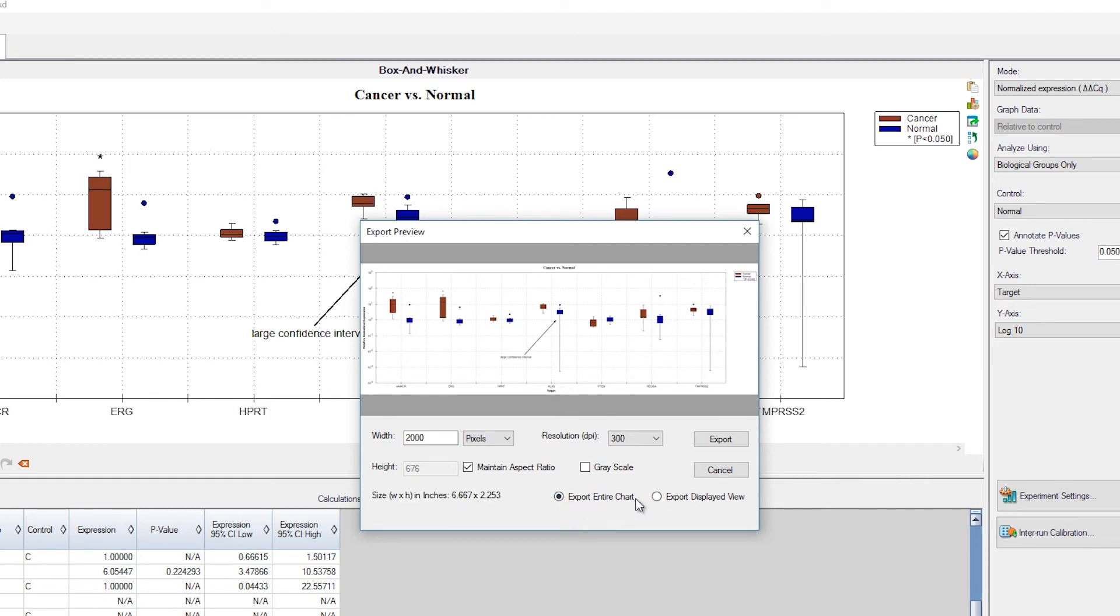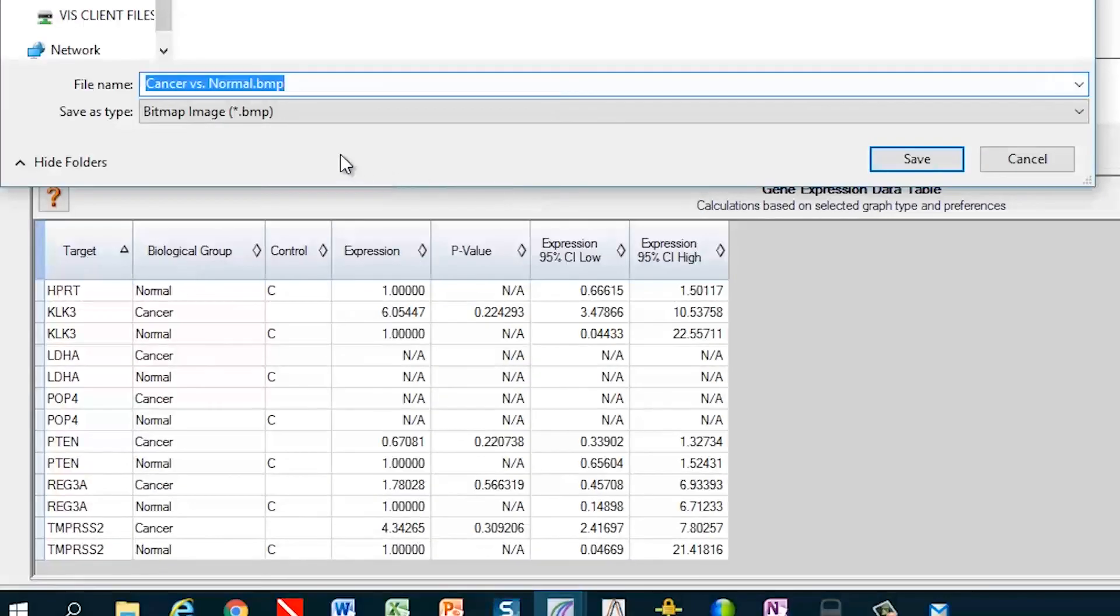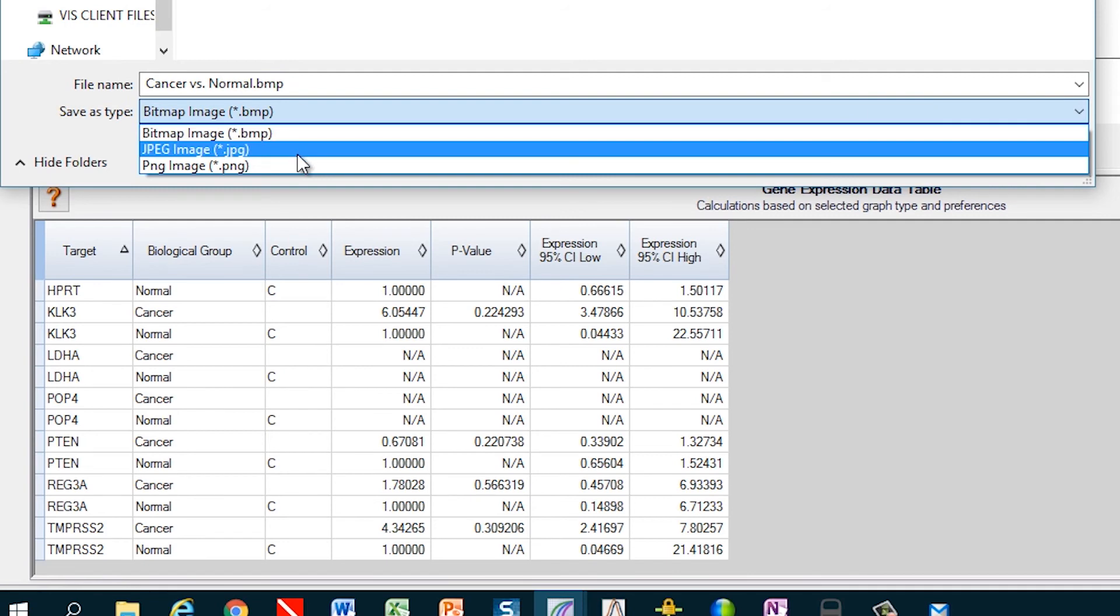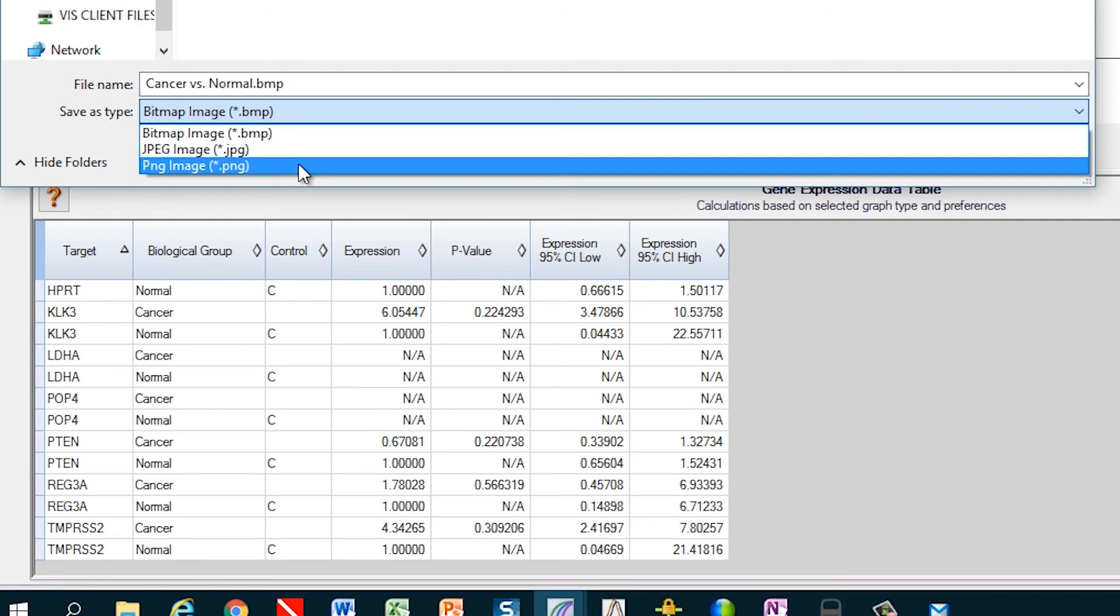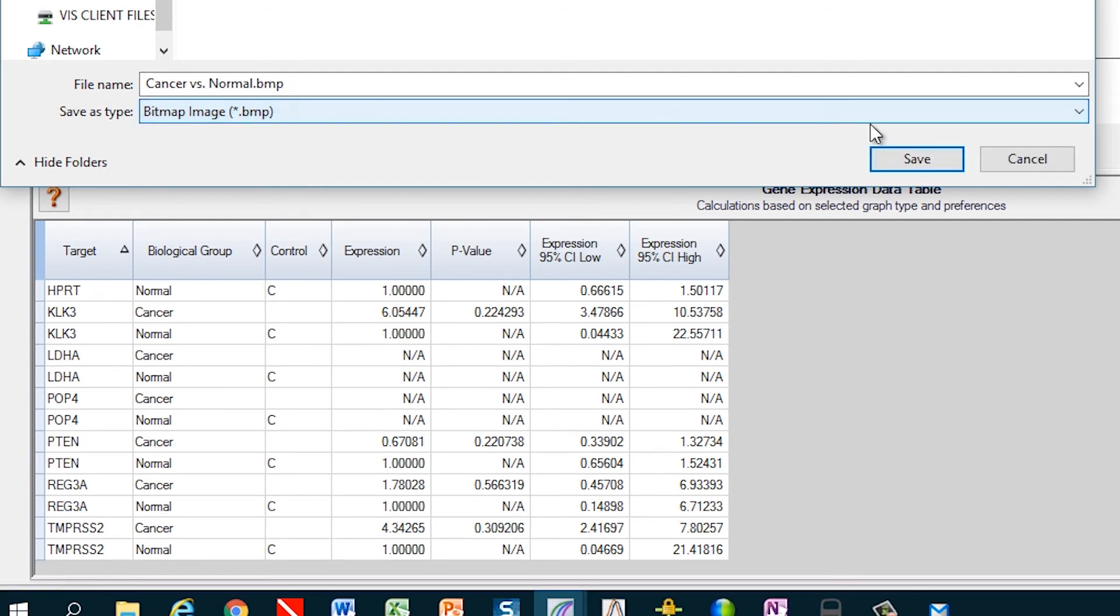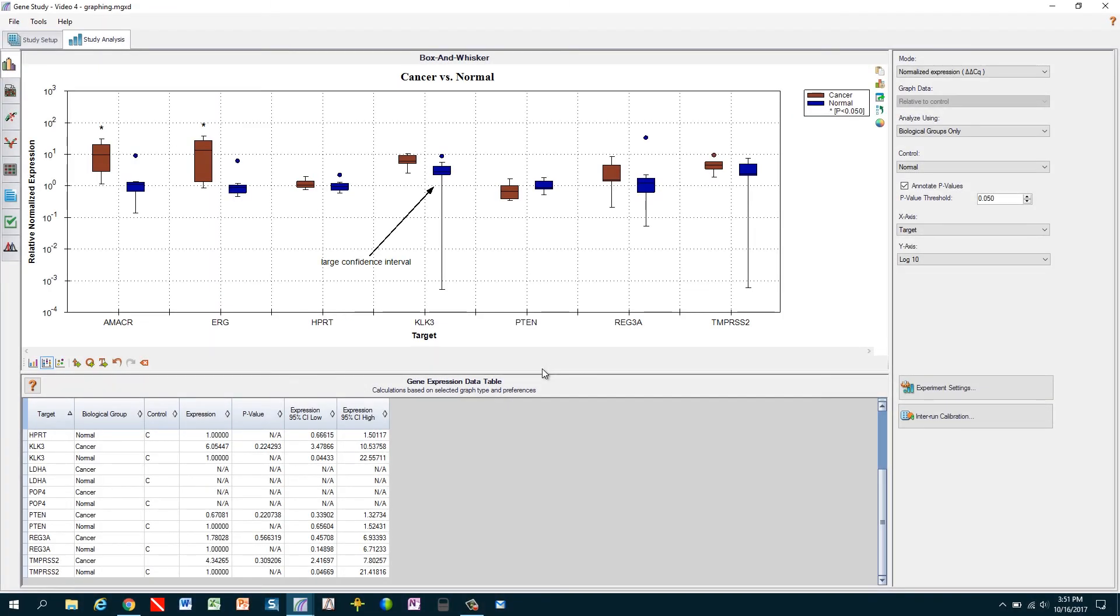The last step is to choose an image format, either bitmap, jpeg, or png. Overall, these options provide flexibility and allow for the export of very large, high-resolution graphs, perfect for presentations, publications, or large-sized printing for posters. These export options are also available for most of the graphs and charts in CFX Maestro.